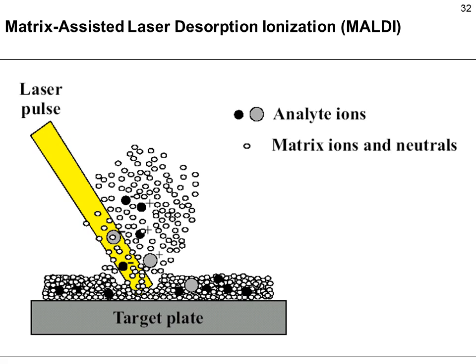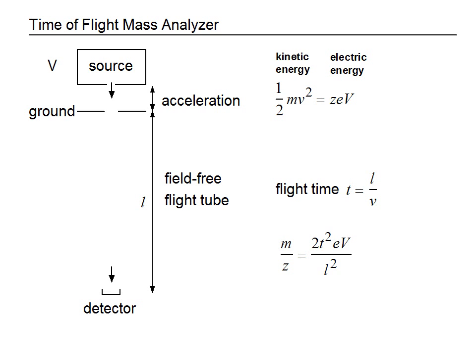We've already heard about matrix-assisted laser desorption ionization, or MALDI. Just to remind you, this is a pulsed laser technique, which is very important to connect it to the following mass analyzer. This is discrete ionization: packages are evaporated by the laser pulse at somewhat 100 or even 1000 Hertz. That means 1000 laser shots per second. This is ideally coupled to the time of flight, or TOF, mass analyzer.